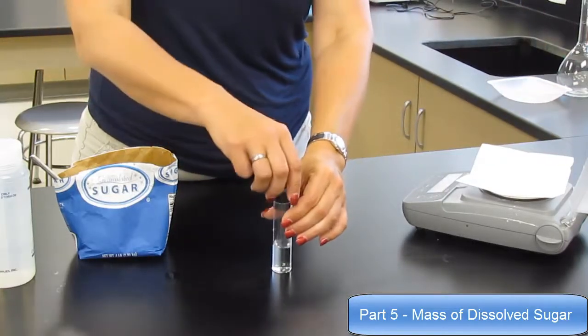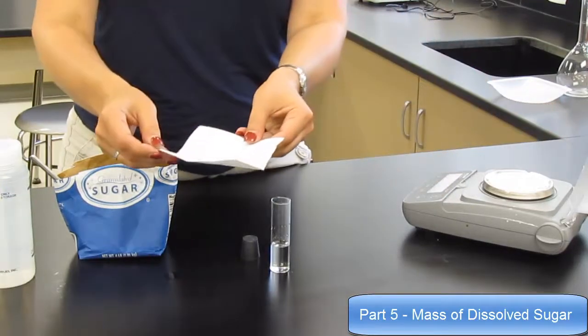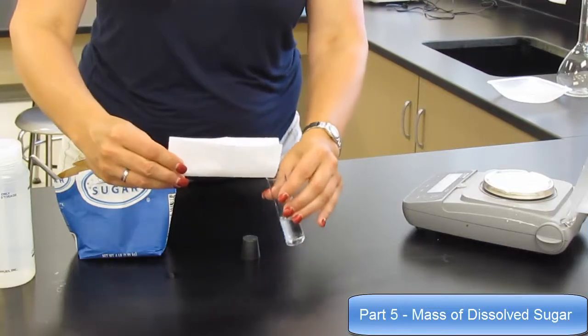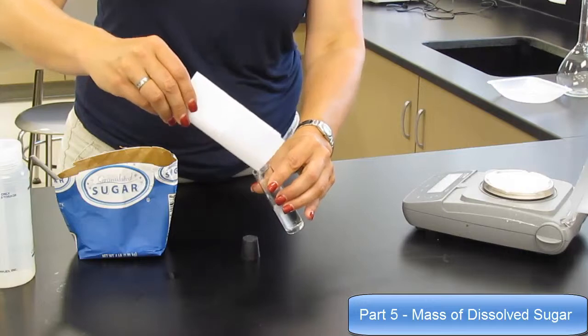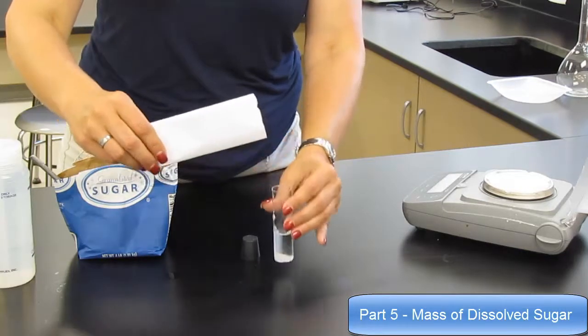Then take your vial, remove your stopper, and now with your tare paper, and the creases make this a lot easier too, fold the tare paper up a little bit, and you can easily pour the sugar into your water. Don't throw the tare paper away yet.